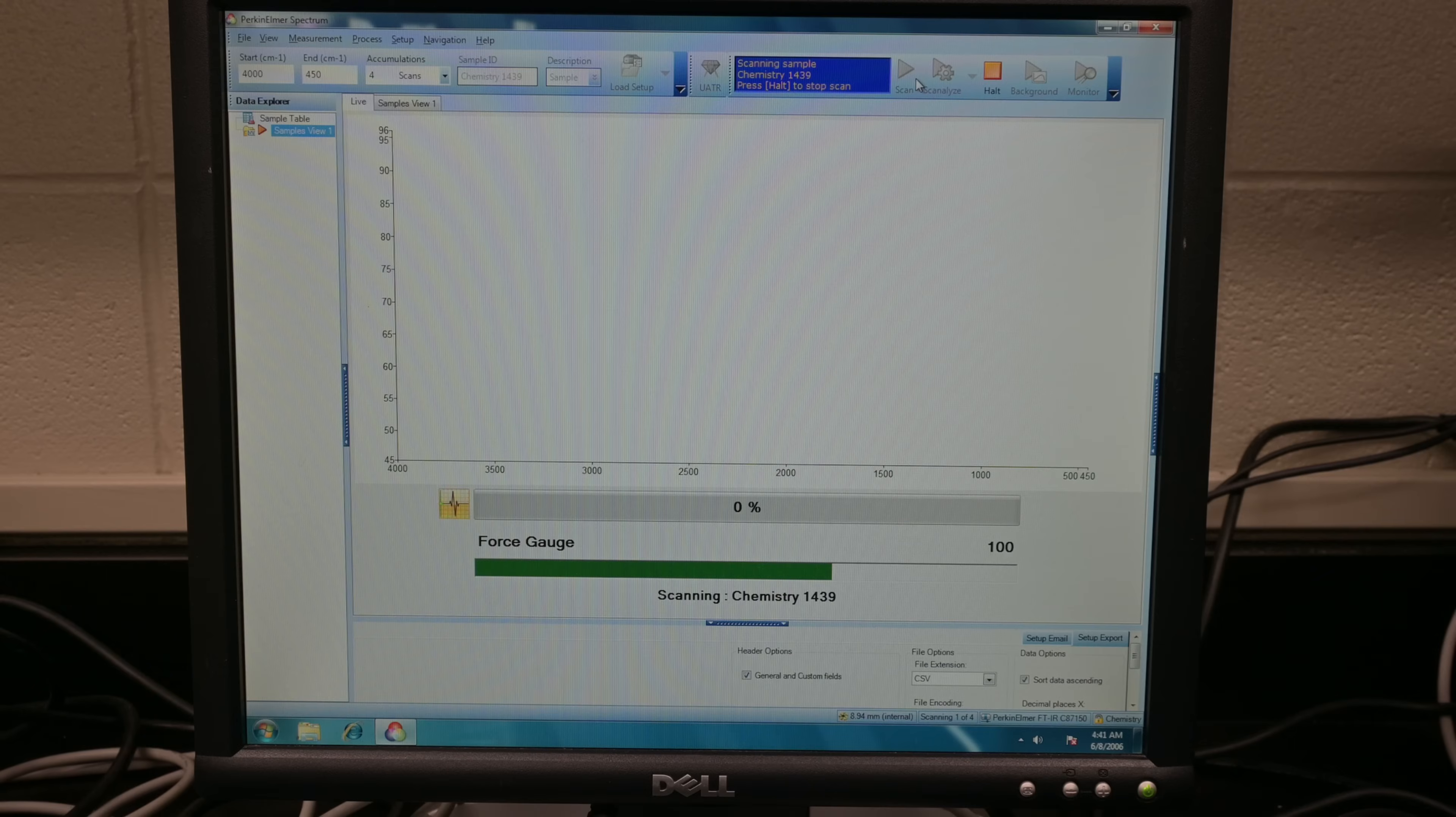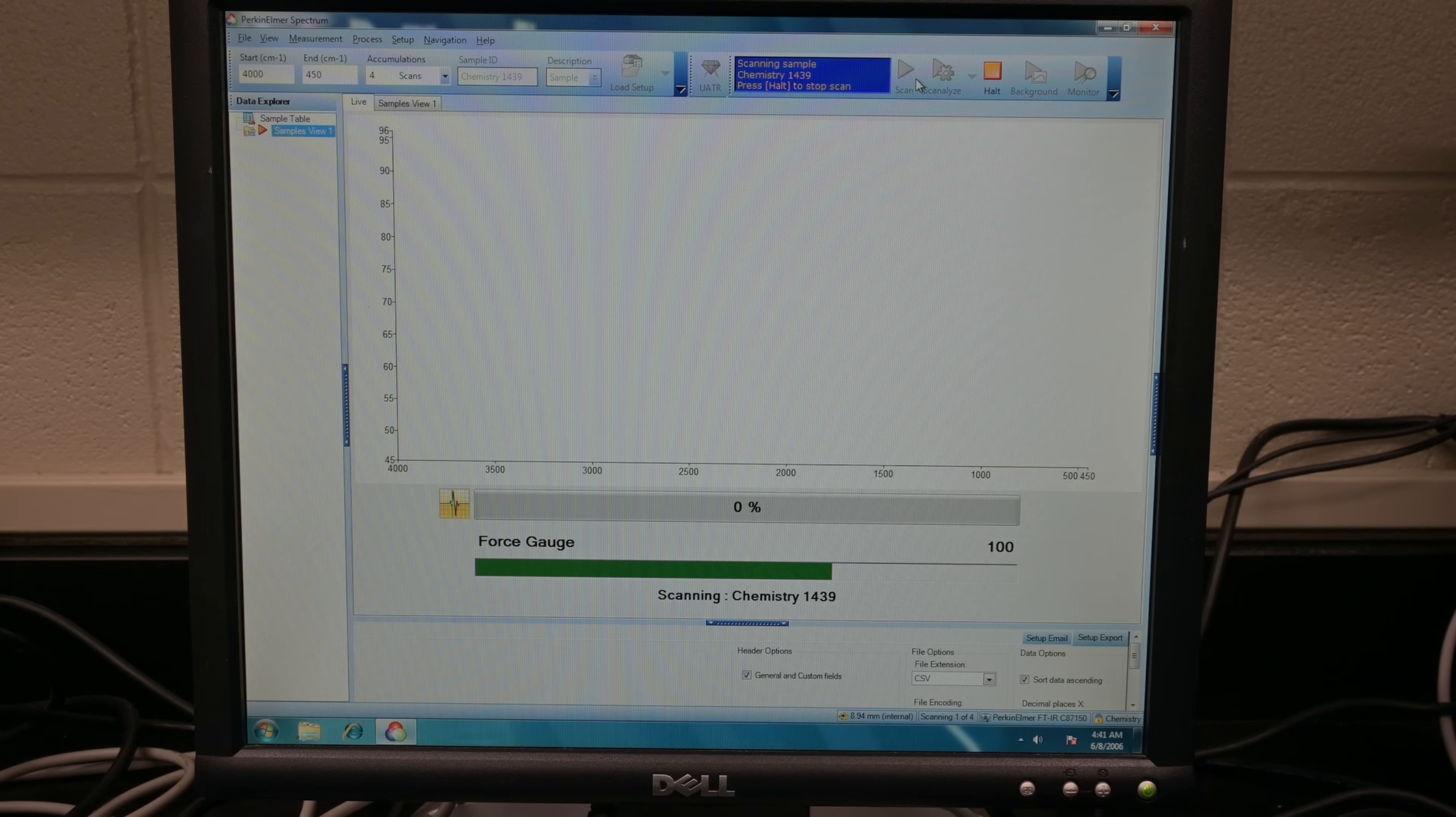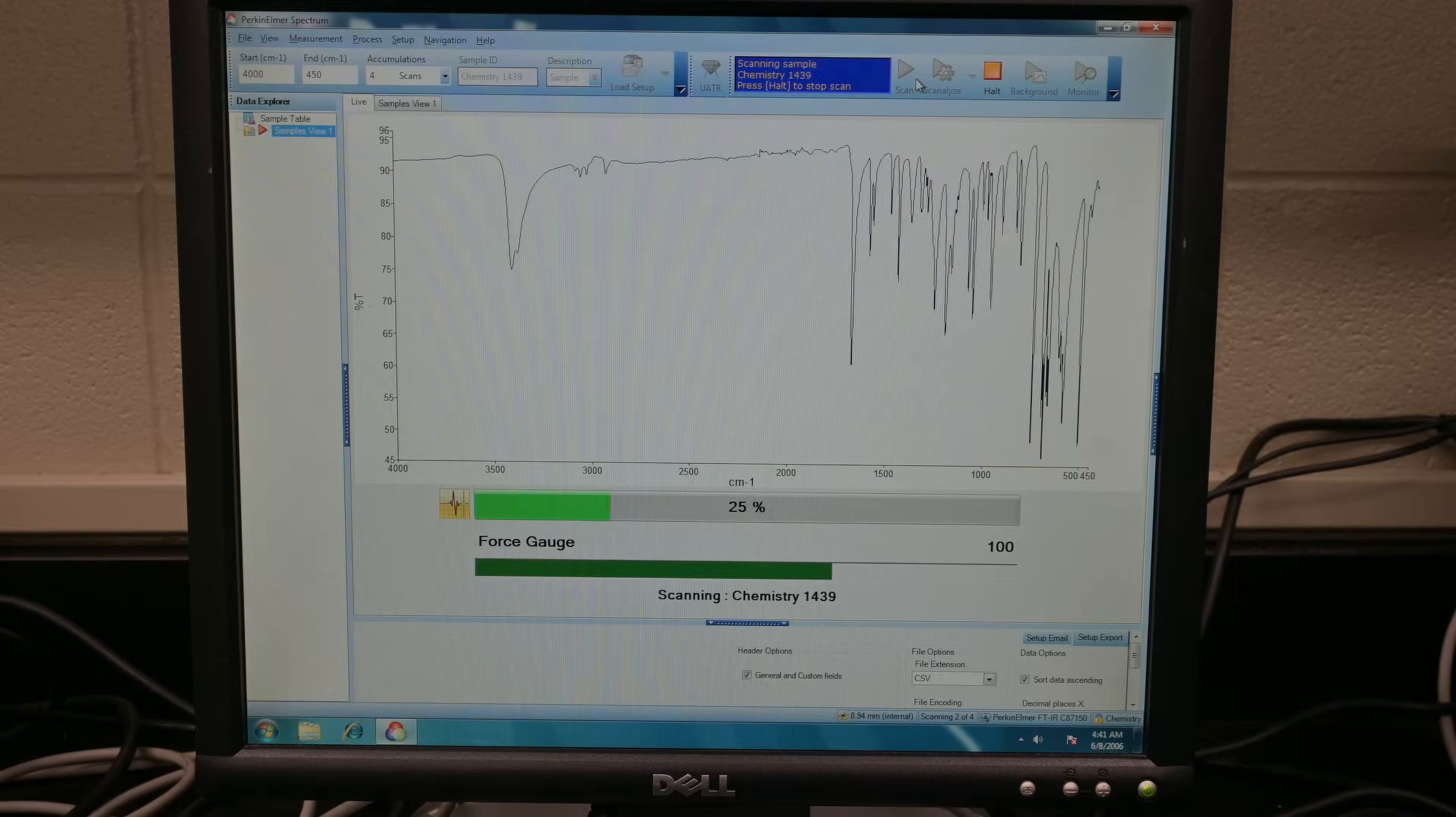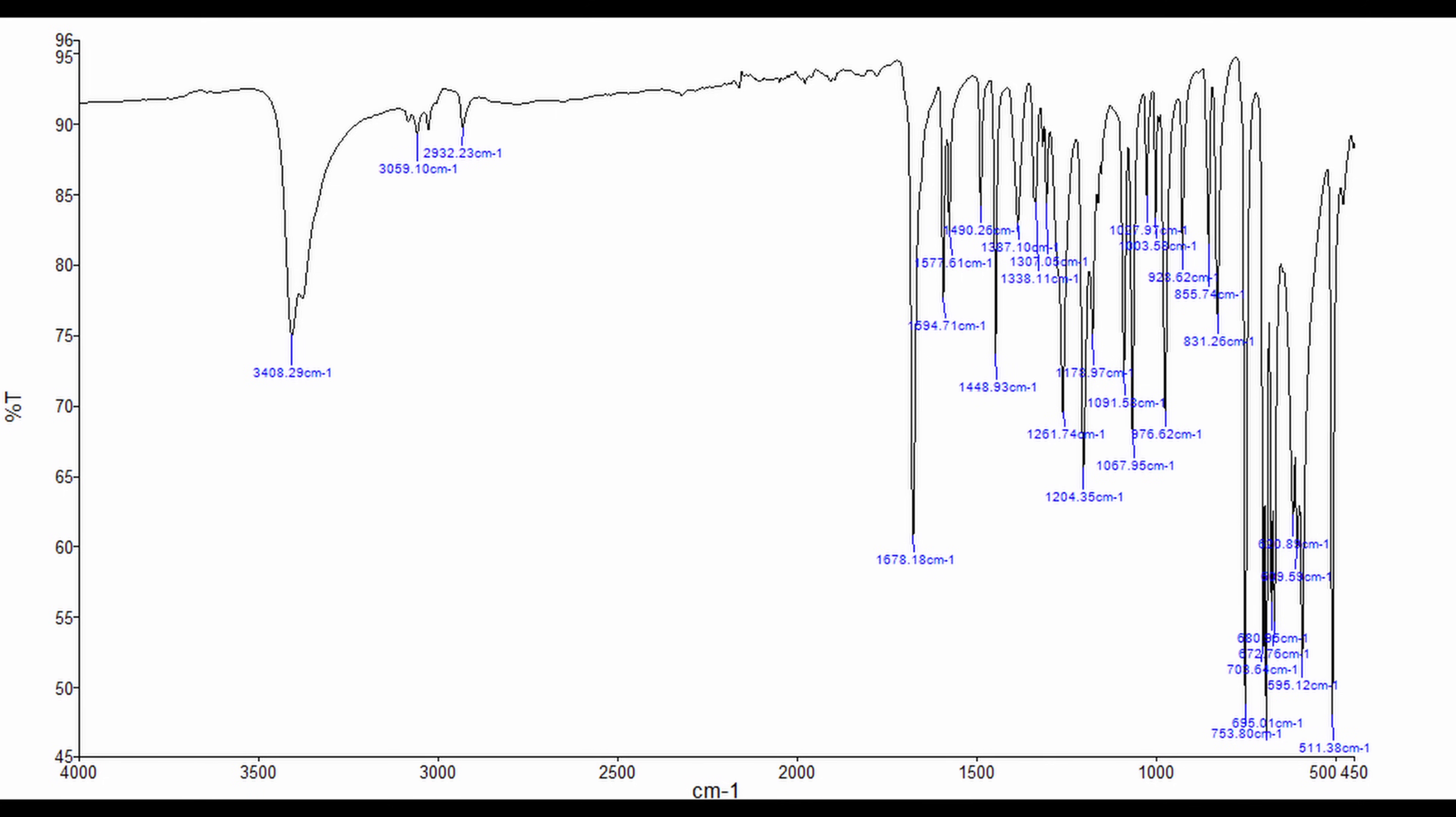Let's begin with benzoin. The FTIR spectrum provides critical evidence of benzoin condensation reaction success. Benzoin formed from benzaldehyde showcases characteristic peaks due to its unique structure. Specifically, the FTIR spectrum from benzoin primarily displays a broad hydroxyl group, O-H, which typically appears around 3400 to 3200.